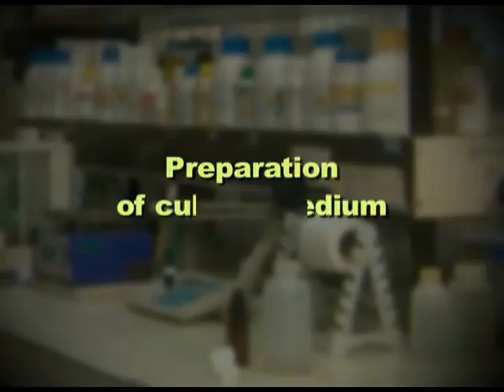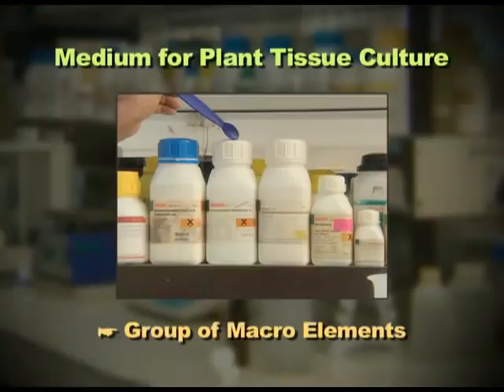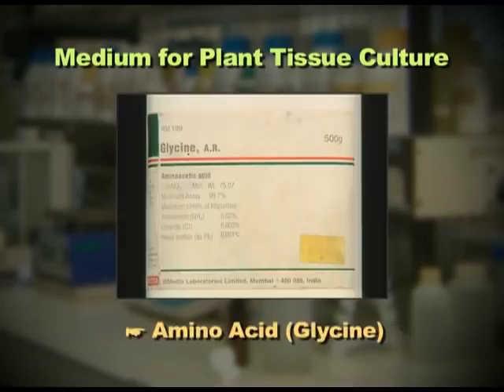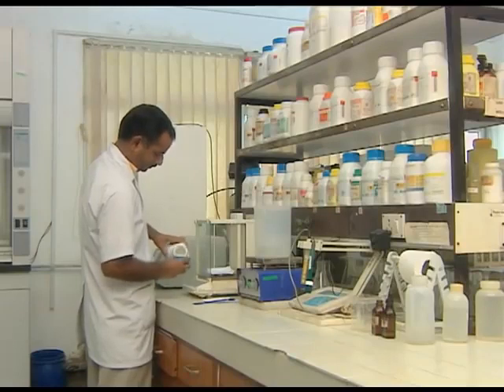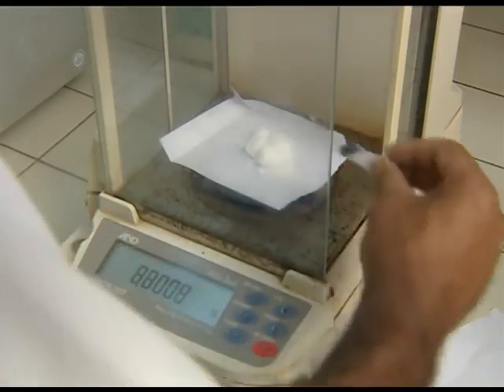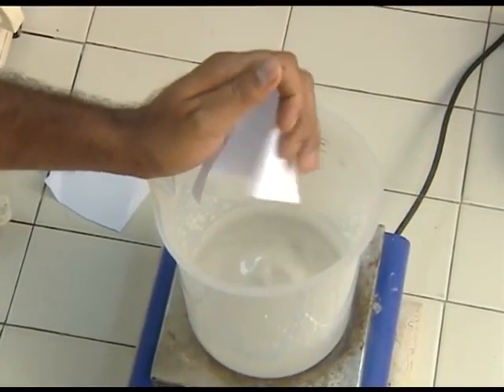The next important process is preparation of a medium which is to be used in the process of micropropagation. A medium for plant tissue culture will comprise a group of macroelements, a group of microelements, vitamins, amino acids, and most importantly sucrose, which serves as a source of carbon and which is the carbohydrate for the plant. The amounts of salts to be taken have to be precisely weighed as per the reported formulations, and these have to be dissolved in deionized water.